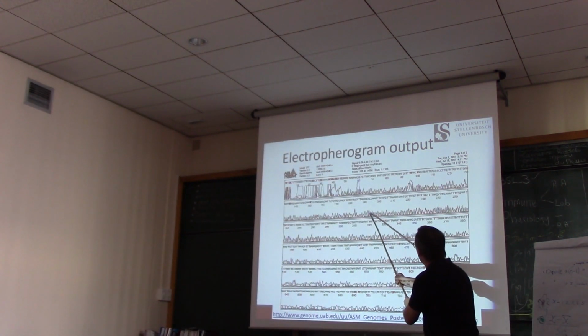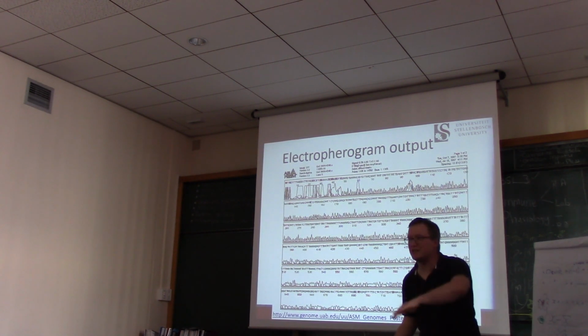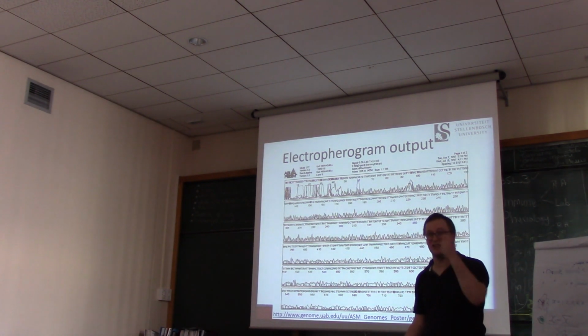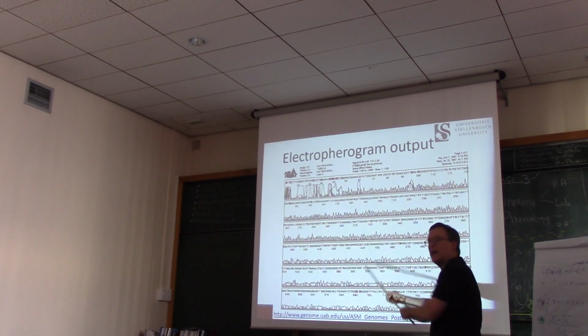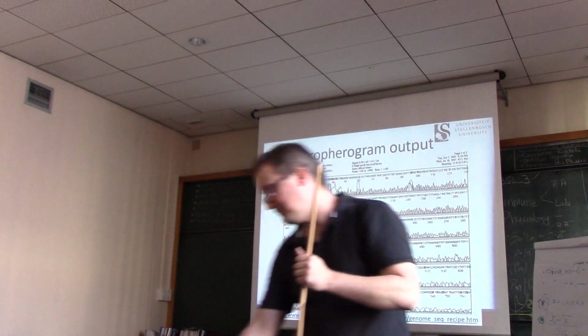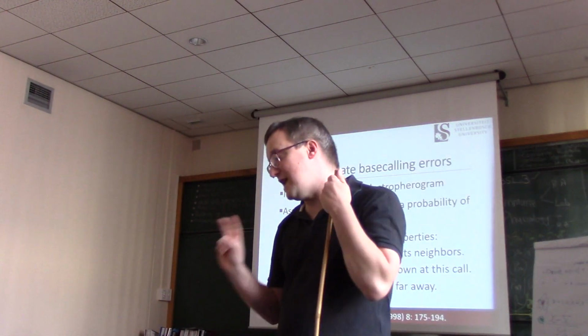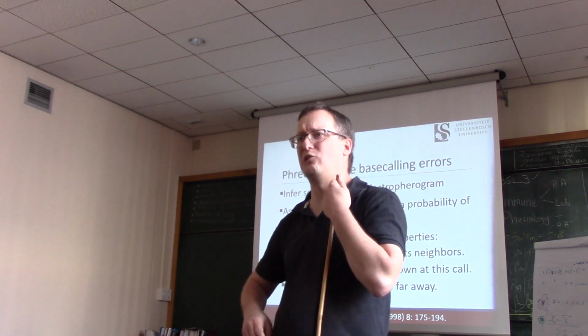We have a thump, thump, thump, thump that is reflecting the increase and decrease in amplitude as a function in time. And so these electropherograms have a beat that we need to be able to evaluate in our software. All right. Next, only one trace is concave down at this call.